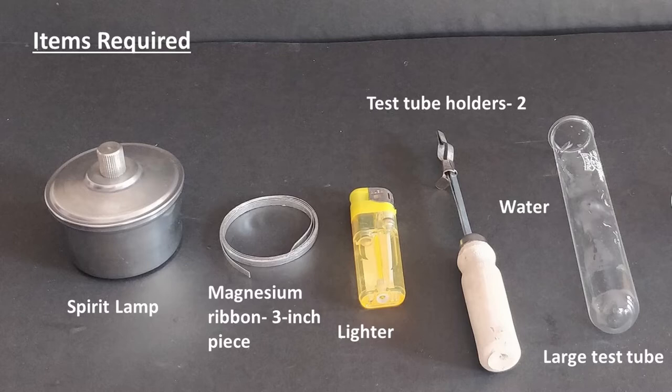For this, we will require a spirit lamp filled with surgical spirit and a lighter or matches, a large test tube, a magnesium ribbon piece about 3 inches long, and 2 test tube holders to hold the piece of magnesium and the large test tube.